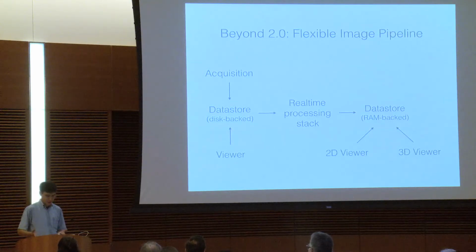So this is going to provide building blocks for a much more diverse range of things that you might want to do in conjunction with image acquisition. And we hope that this will make it a lot easier to integrate µManager-based acquisition to downstream processing and analysis tasks.